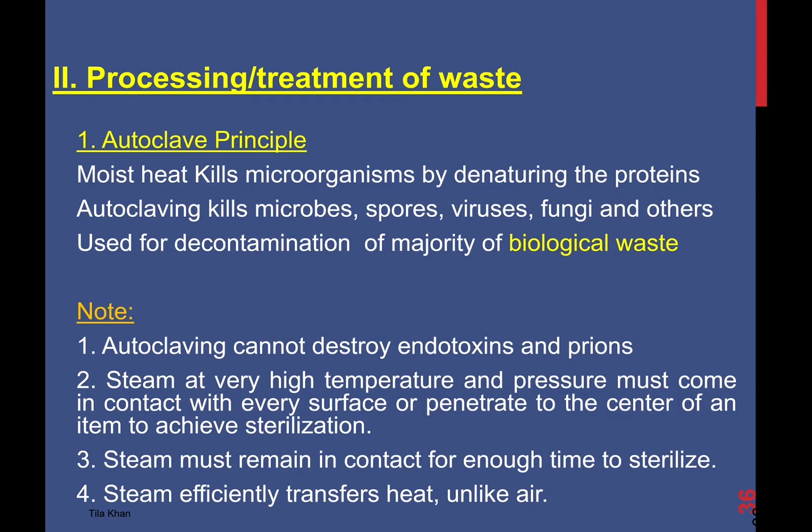While autoclaving, whenever you bag your waste for autoclaving, please make sure that steam at very high temperature and pressure comes in contact with every surface or penetrates to the center of an item to achieve sterilization. If you bag the items too tightly, then steam may not be able to penetrate to the center of the item.